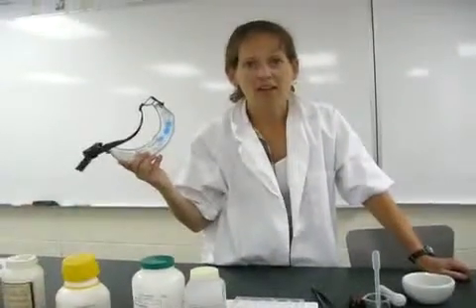Once you are finished, you will clean up as directed by the teacher. You will remove the goggles and you will answer lab questions. Excellent.